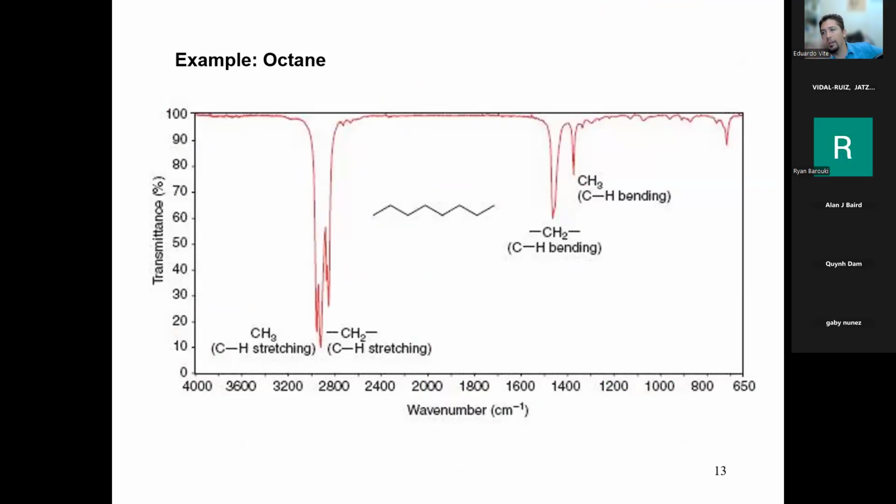It's no double bonds, no triple bonds. It's just carbon-hydrogen single bonds, sp3. So what do we observe? Well, when we look at these spectra, let's always start with the higher wave number, right? So let's start over here at around 4,000, 3,000. Let's see if we see anything. What do we see? Well, I see the stalagmites, right? Look at this. Stalagmites. Well, I know these are my sp3 CH stretches.